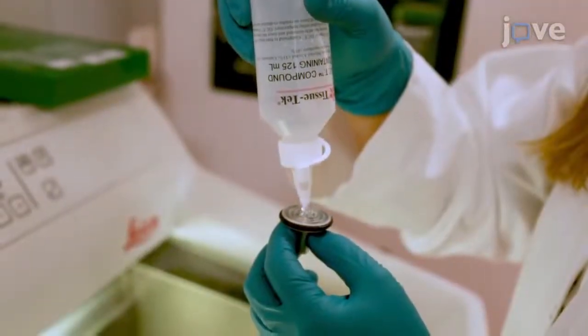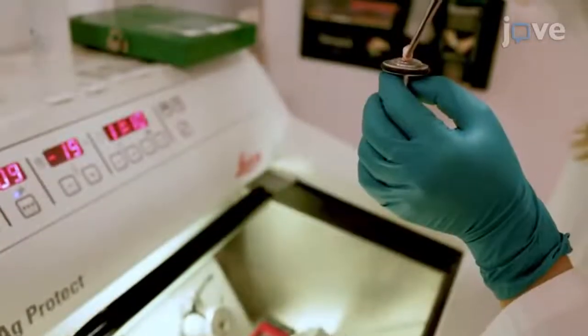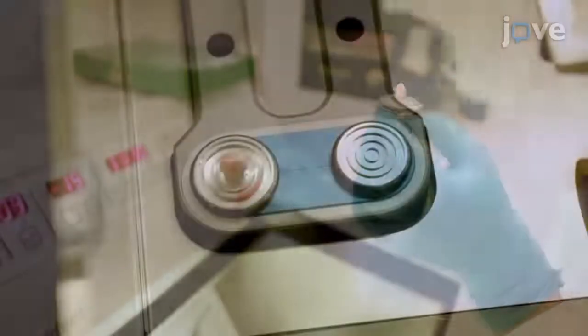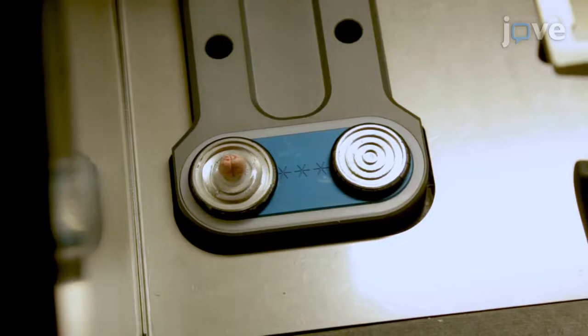Then, cover the tissue holder with embedding medium outside the cryostat and quickly place the frozen tissue specimen in the desired orientation while the embedding medium is still liquid. Transfer the tissue holder back to the cryostat and expose the embedding medium to temperatures below minus 10 degrees Celsius for hardening.